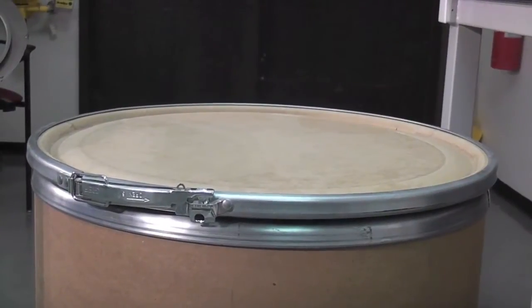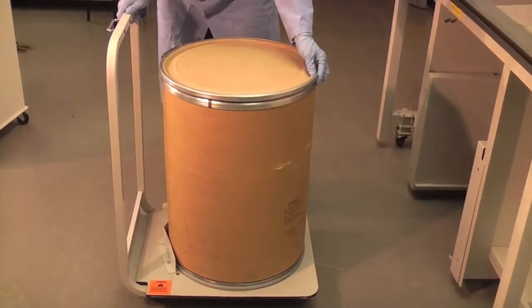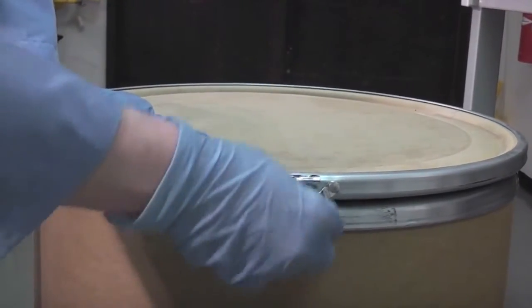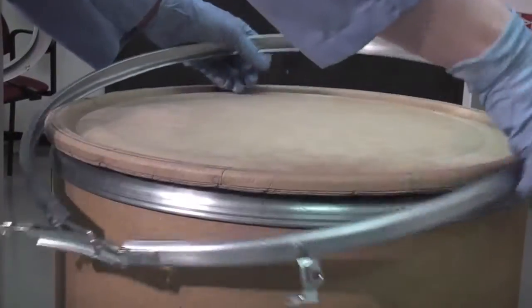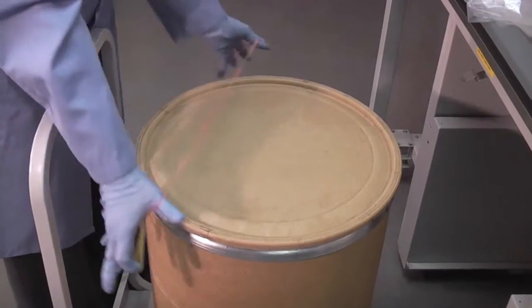Load the source container onto the transfer caddy. When loading, center the container against the stop located on the platform. Loosen and remove the lid clamp on the drum. Place a safety sleeve around the container and secure with the retaining band.